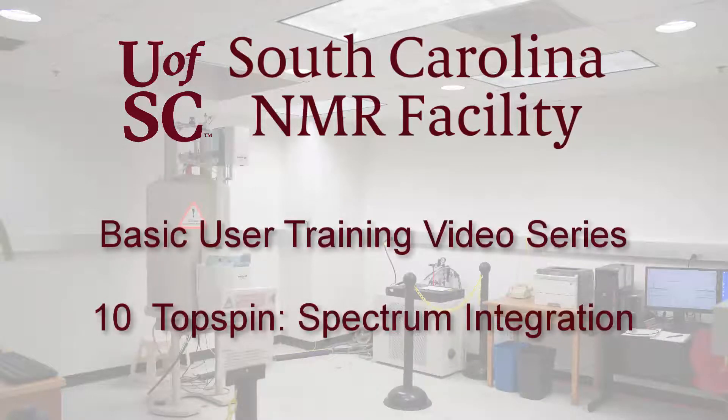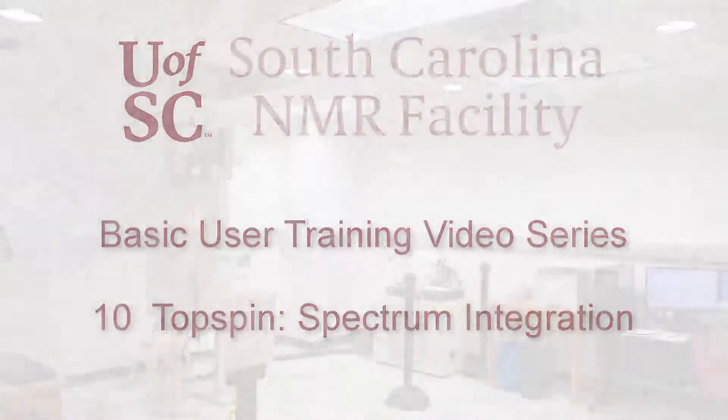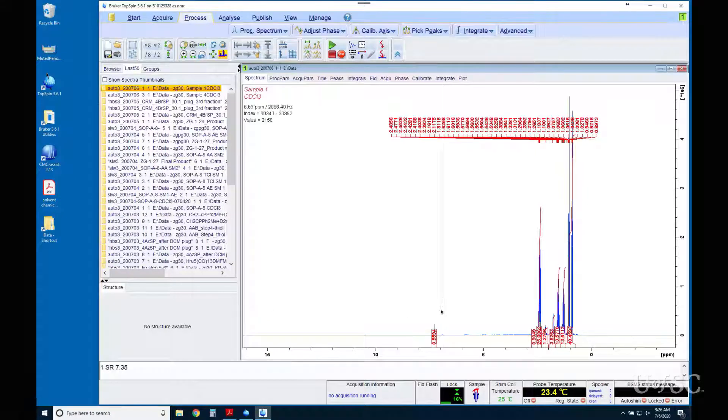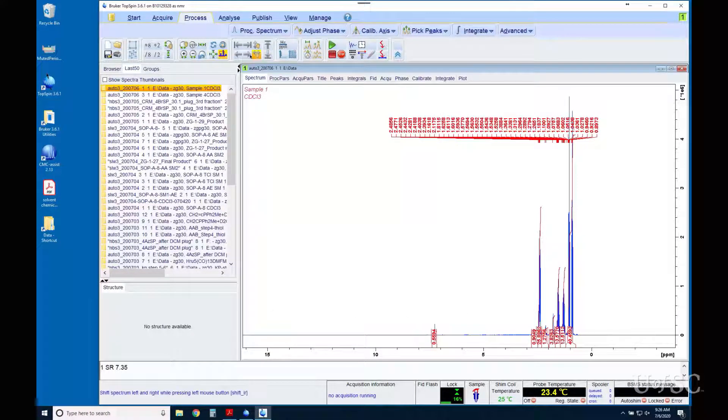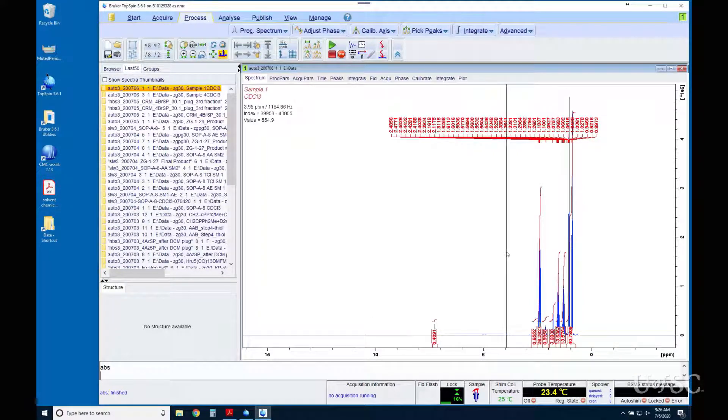In this video we will cover NMR peak integration. The output of ICON NMR collected proton spectra will have integrals set by a command called ABS. This command decides what peaks are significant enough to integrate and cuts up the spectrum into regions that contain one or more resonances.